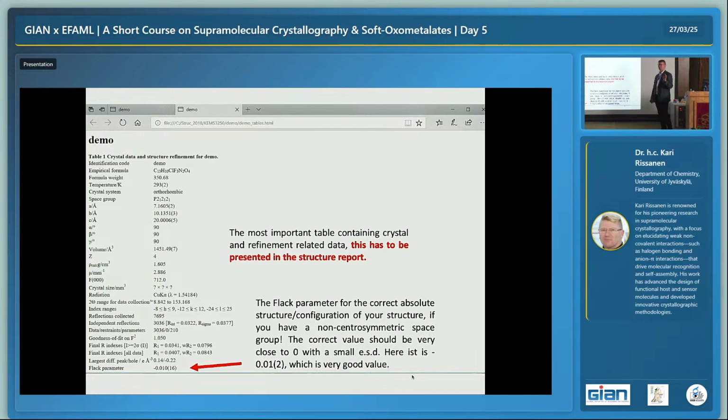But it disappeared some 10, 15 years ago when the CIF came, what is a CIF? That's the crystallographic information file, with the program writes. When this became available, then it said, okay, you can find this information either from the SI or from the database. Typically, this information is now given in the SI. Sometimes you might report these inside the paper, but typically it's not needed. So the most important is the crystal refinement data. In here, it tells us the name, the chemical composition, molecular weight, and temperature, where it's done.